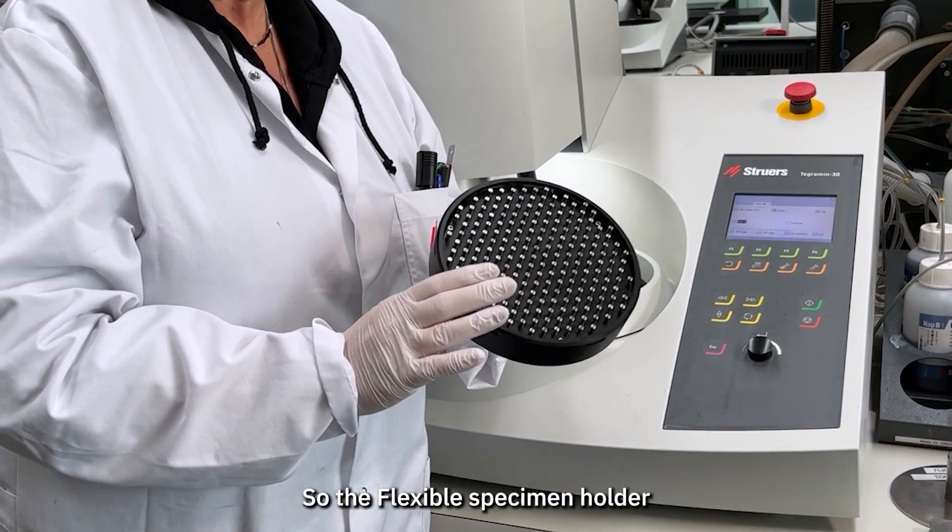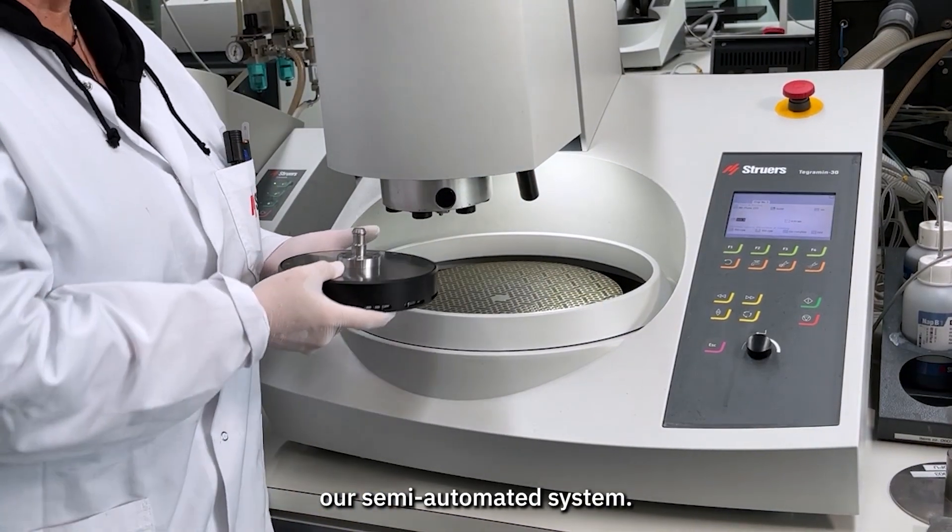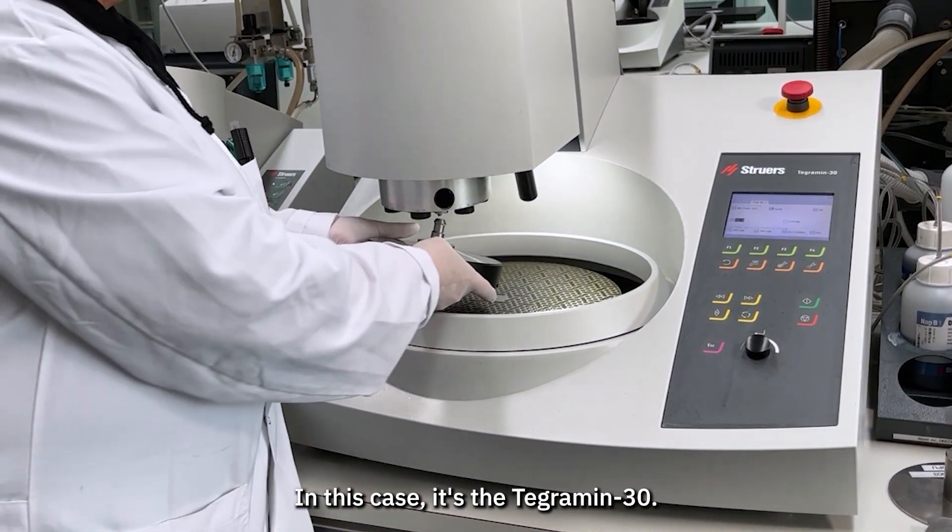The flexible specimen holder can be used for processing on our semi-automated system. In this case it's the Tegramin-30.